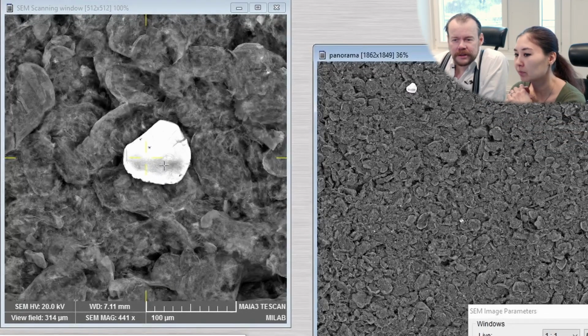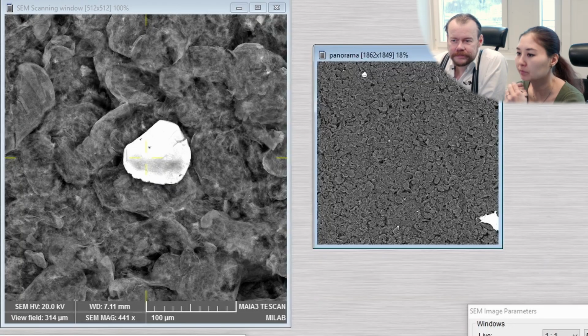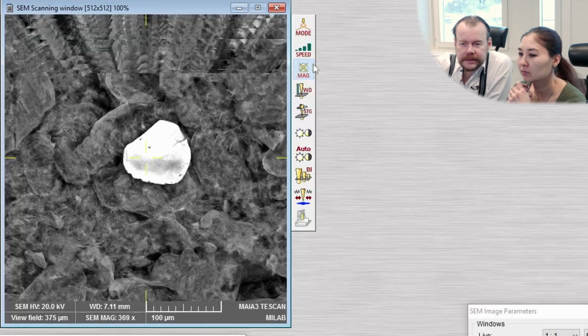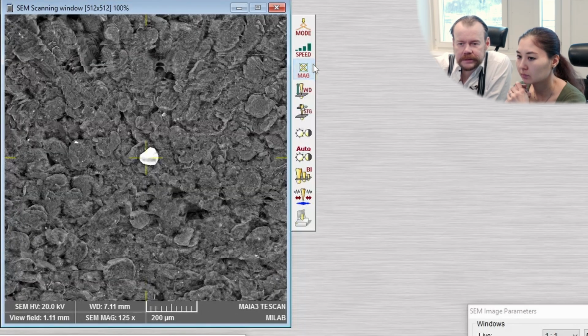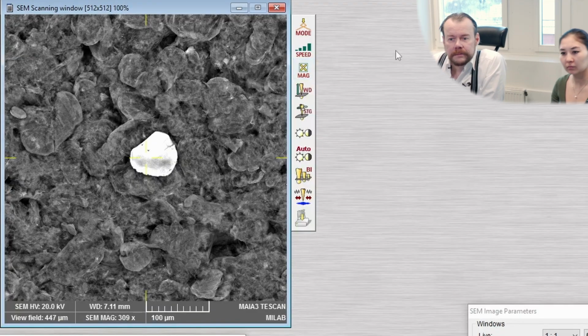Let's go over to the EDS part now. I mean, these particles, we want to analyze those elemental wise. So we can close all these things. But the map we had perhaps is not so bad actually.